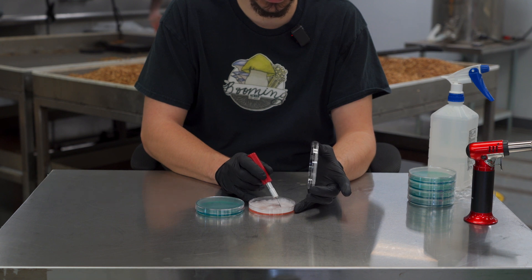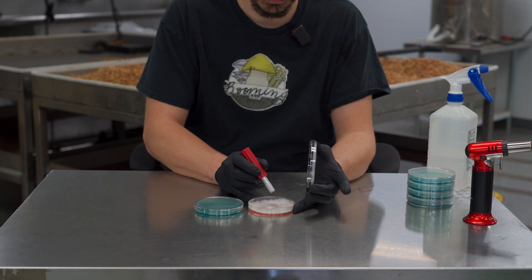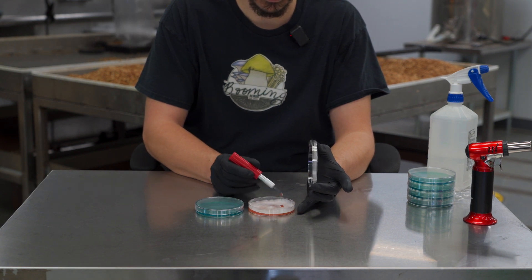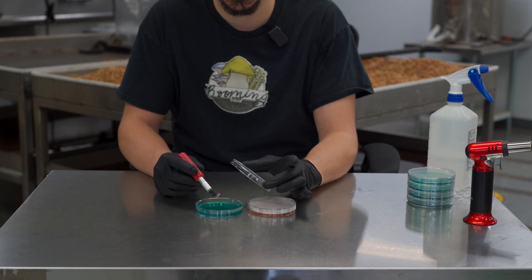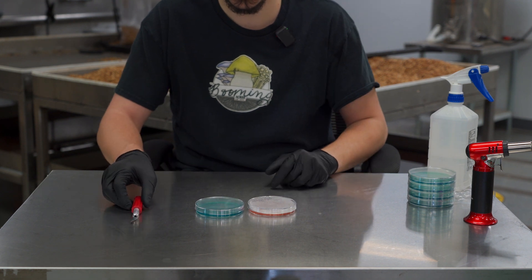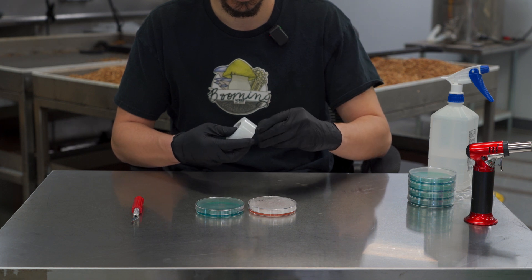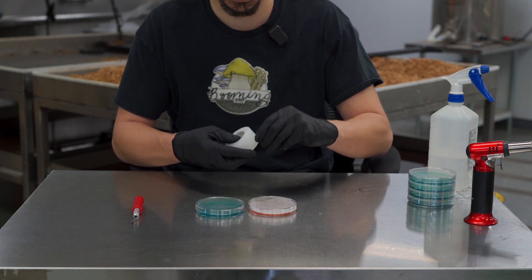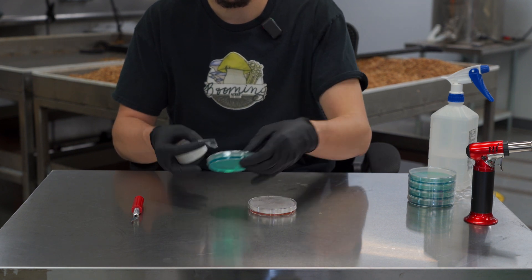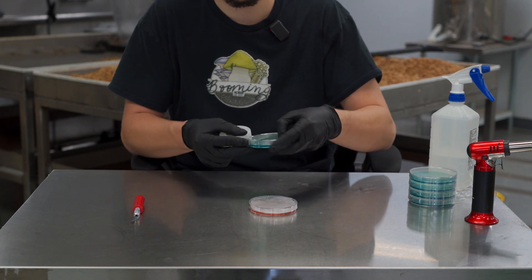Open the sample you're going to be taking from, cut out a portion, and place the transfer in the center of the dish. Then take your preferred method of taping and tape up your new petri dish.